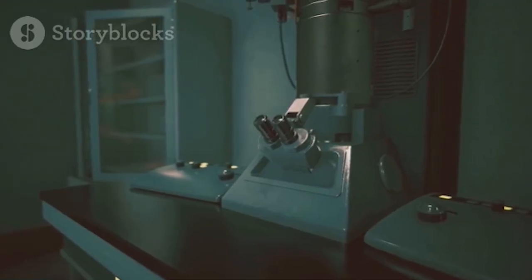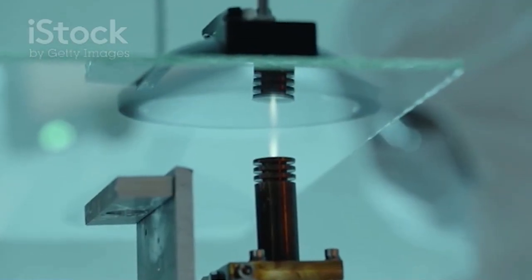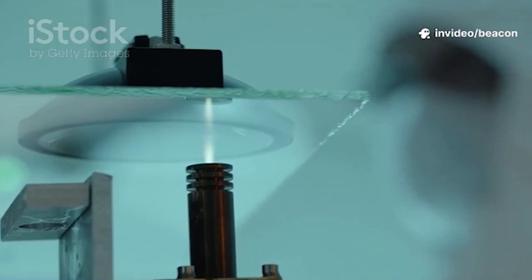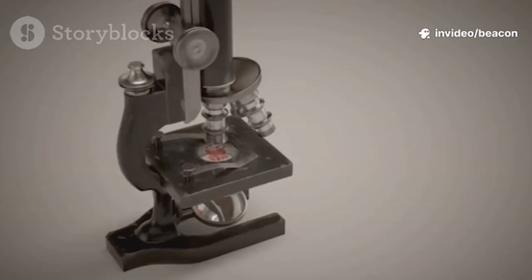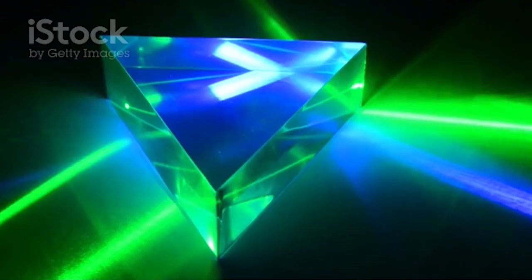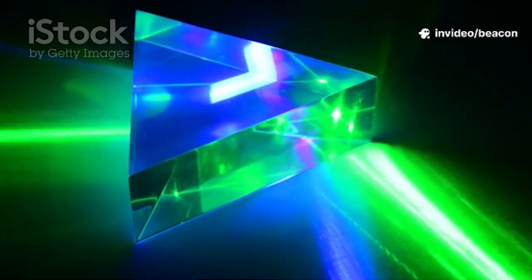Here's how it works. Let's keep it simple. Dynamic light scattering, DLS for short, is a technique scientists use to measure the size of really small particles in a liquid. Think nanometers, way smaller than the width of a human hair. Here's what happens. First, you shine a laser beam right through your sample. As the light hits those tiny particles, it scatters in all directions. But here's the cool part.